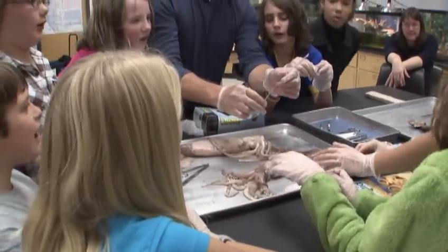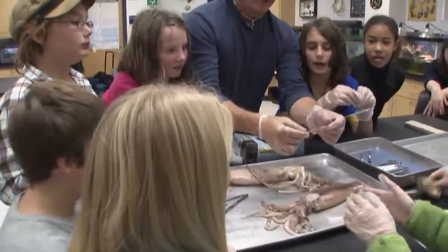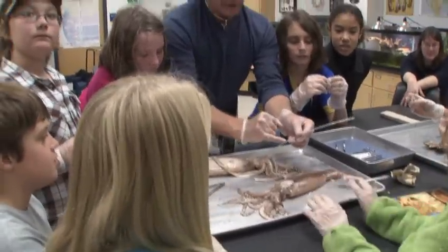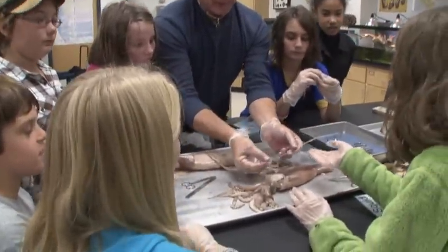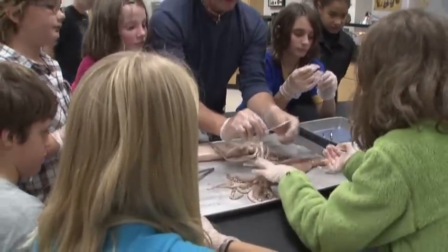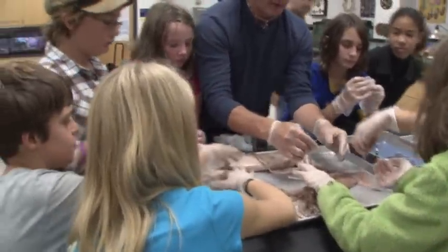See? Whoa! Isn't that cool? Like the bone. Now, I didn't wreck it too badly. Remnants of the shell. But look, see these ridges here? Now that matches up with the support up here. It gets real thin down there, see? And then it flares out again where the fins are.